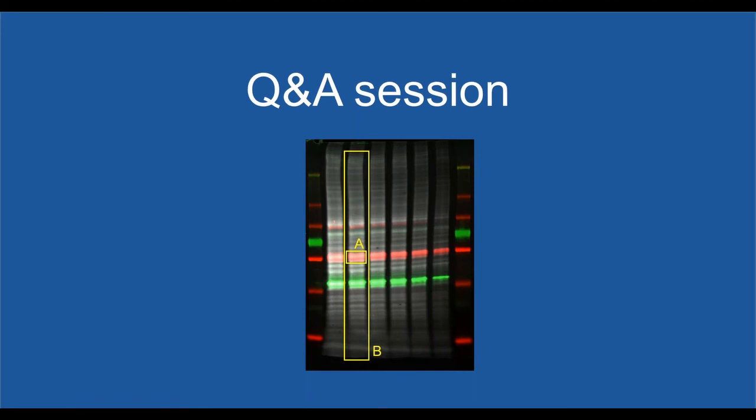Then you cut the part out, straight away send it for total protein staining, and then check whether the stainings are good and the signals are good. So this is a way to try it out with a fresh blot. If it's really that good, then you know that the problem lies in the storage condition of the blot itself, not the staining itself. It might provide you more insight into this. I hope this will help you.